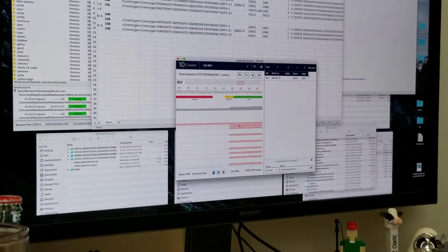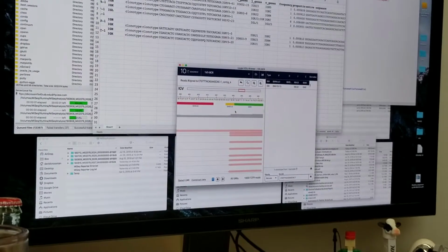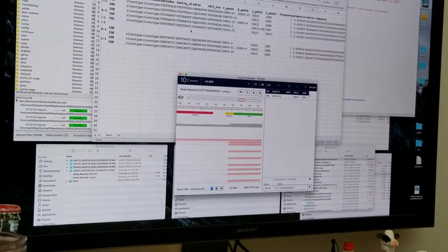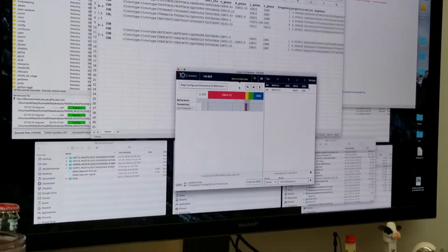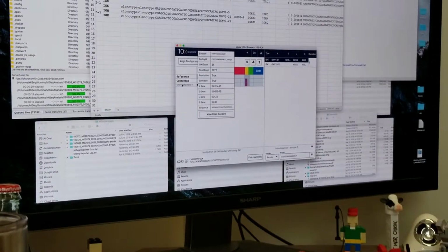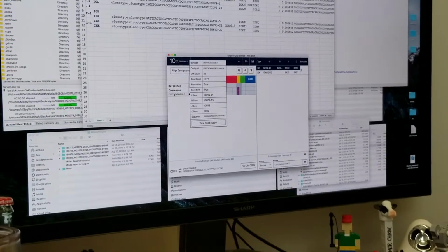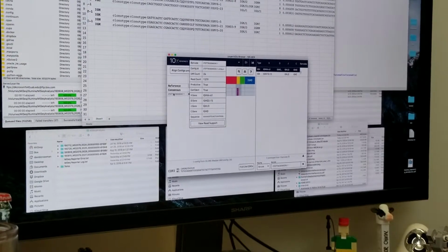All right. So, can you analyze the D region? I didn't want to actually analyze the D region, but maybe it's useful. Is there a way to just get the sequence and see how that compares to the database of that D? There's a D there, and I don't even know what D it is. What's an easy way to do that? And it tells you what D gene it is. We want to say that's the D gene it came from, but how many real mutations are there, and what does this cell have?